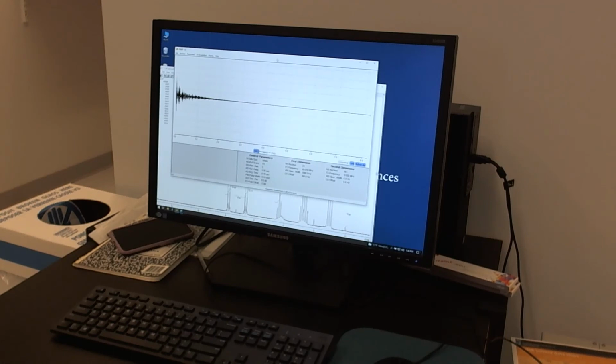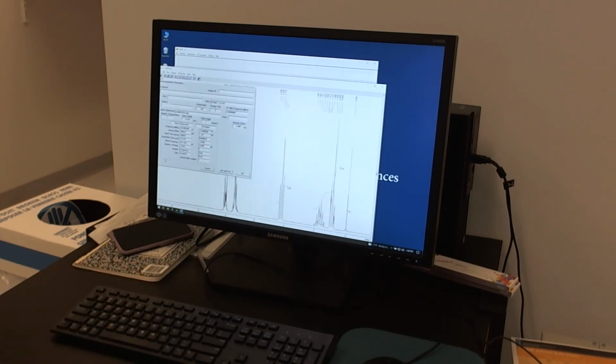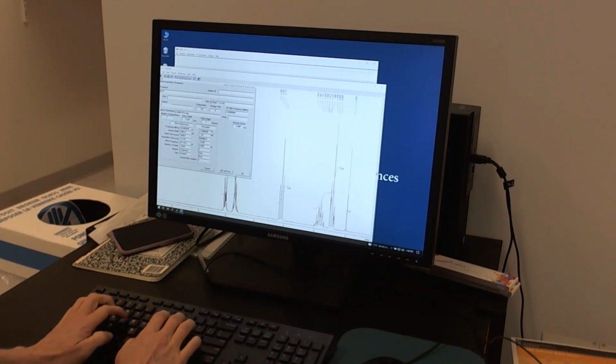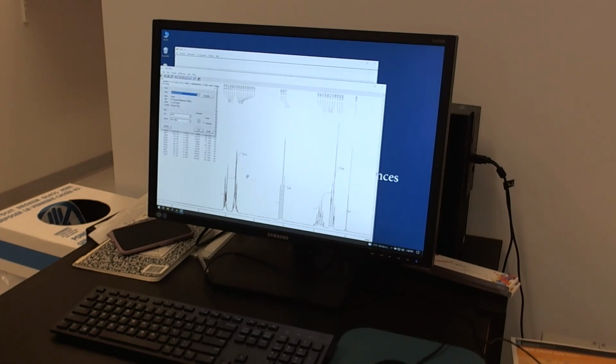This is the expected situation, and now, to view your data in a form you're used to looking at, you want to click on NUTS. So that's this back program. Now it's still showing me what I originally saw. This is the person before me, their data. To import mine, I hold Control down with the F1 button. That processes my data automatically. You can type your name in the comment box, click OK, and that sends it to the printer. Sometimes you have to hit OK again.